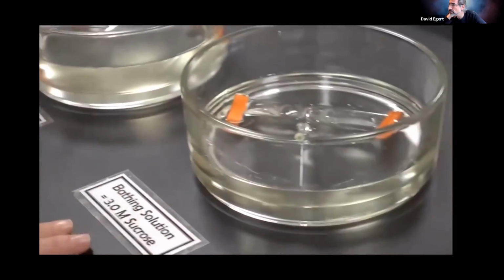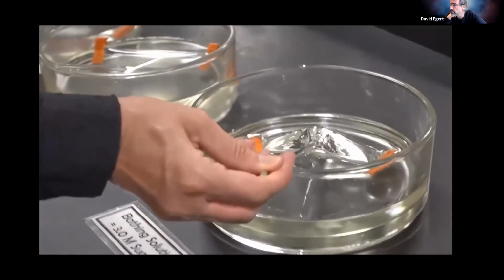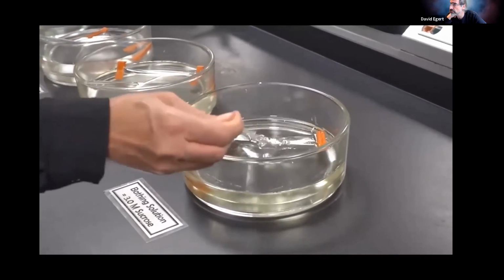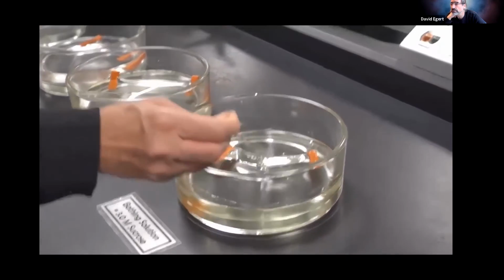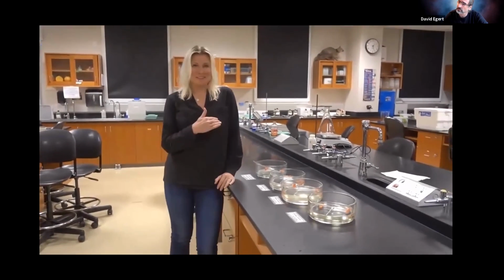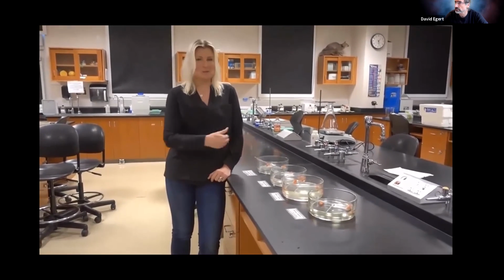And then if we go to the one that's been put in a more concentrated solution, you can see that it's pretty soft and flaccid. So obviously this sausage has lost water to the outside solution. All right. Now it's up to you to figure out exactly what happened, which way did water move, and what do we call the solution that we put them into.